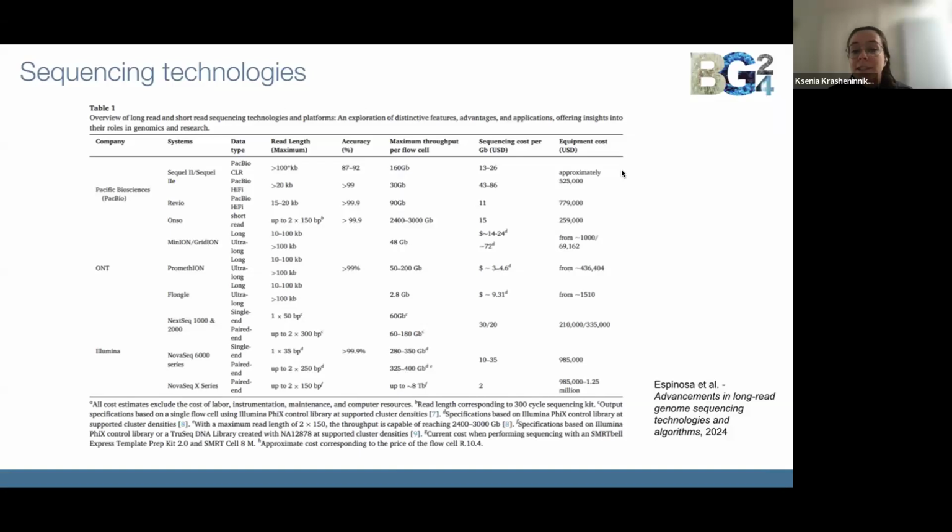Sequencing costs have been constantly decreasing. The initial draft of the human genome achieved through Sanger sequencing had a cost of $3 billion and took over a decade to complete. Now, with the NGS platforms, billions of reads can be produced in a single run within a few hours or days, and a high-quality full human genome assembly will cost a sum of several hundred dollars. PacBio, Oxford Nanopore, and Illumina are among the most widespread sequencing technologies nowadays.